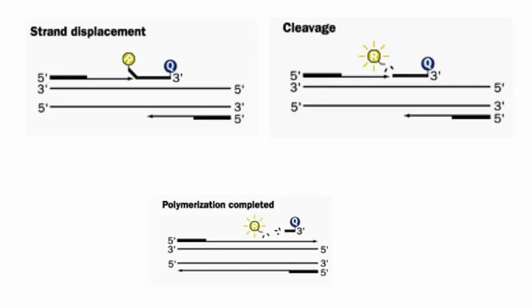So when the reporter and the quencher molecules are within a certain space of one another, and you hit the reporter with a particular wavelength of light, it transfers the energy to the quencher molecule, and you don't get any resulting wavelengths of light put out.